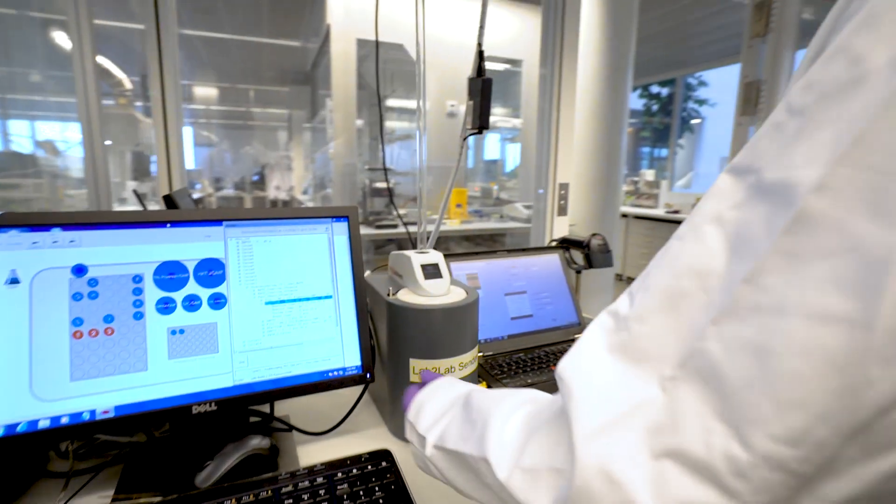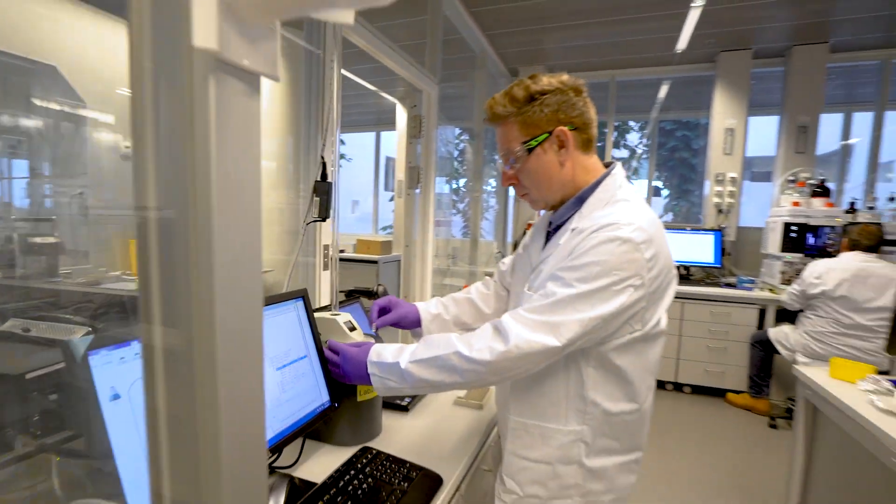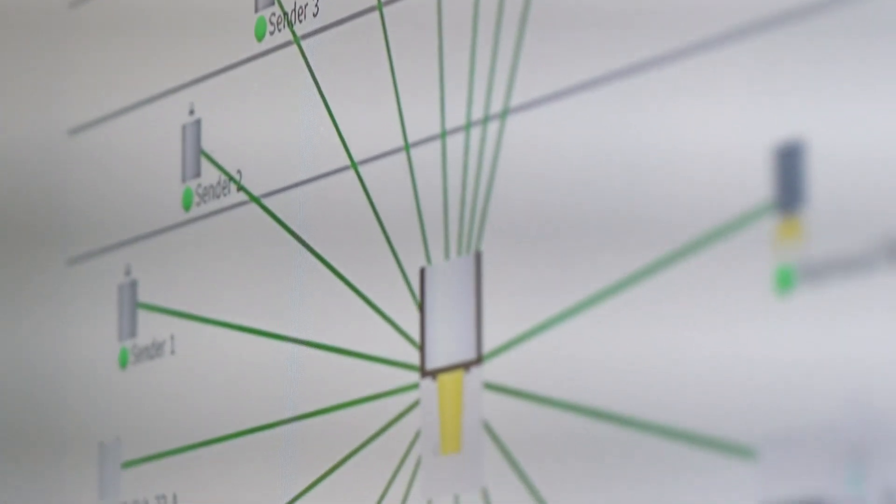Now using lab-to-lab, scientists can send samples without leaving their lab and we can see where everything is simply by viewing the lab-to-lab dashboards.